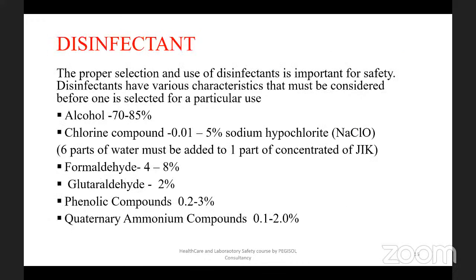So let's talk about disinfectants. The proper selection and use of disinfectant is important for safety. So you must use disinfectant. Disinfectants have various characteristics that must be considered before one is selected for the particular one you are using in your lab or your workstation.